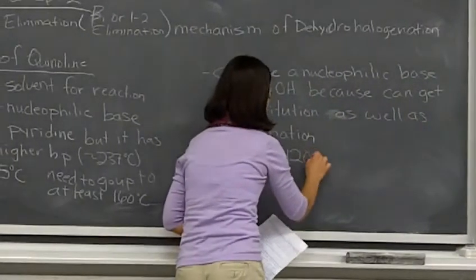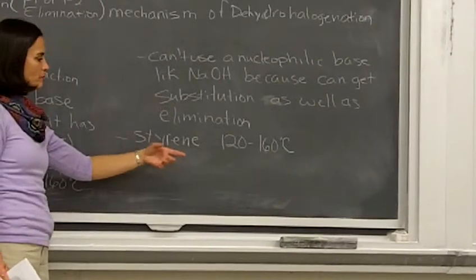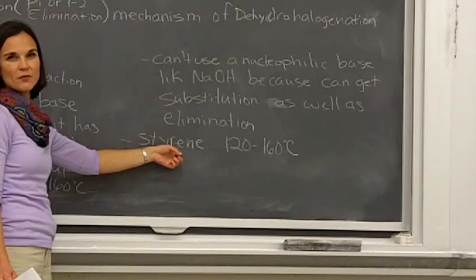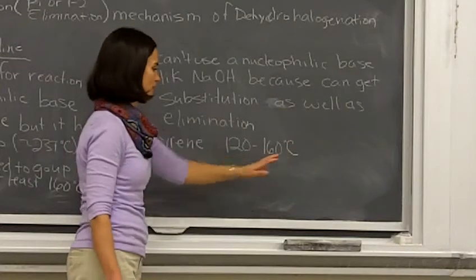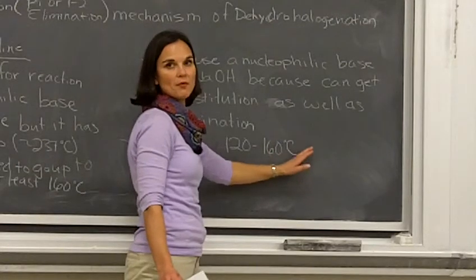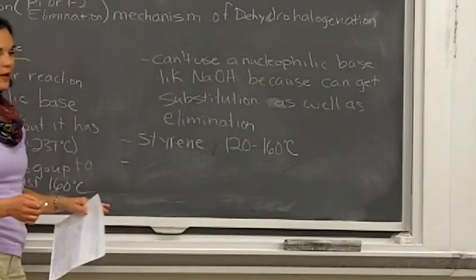And so the styrene, you want to collect that between 120 and 160 degrees Celsius, okay? So in your sidearm test tube, just like you used for experiment 6 for the majority of your unknown, that's where you want to be collecting your styrene, okay? You want to only collect over the range of 120 to 160. So you don't really want anything too much before 120, and you don't want anything after 160. You'll stop your reaction at 160, okay? So thoughts on what could come before 120 for this reaction?